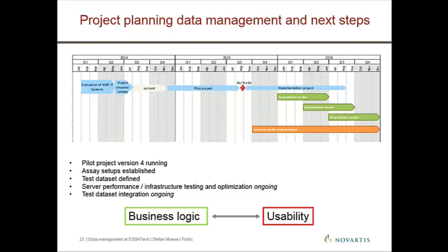Because the idea really is that every lab technician, every person in that department is using it. And they don't care about Labkey, sorry. They just want to get rid of their data and get their job done. And so if it gets too complicated, first of all, they will appear at Ollie's and my desk, which can be nice, but also annoying. But second of all, of course, it needs to be efficient, because you don't want to hold up everybody. And so this is really a huge part of what we have to be working on.